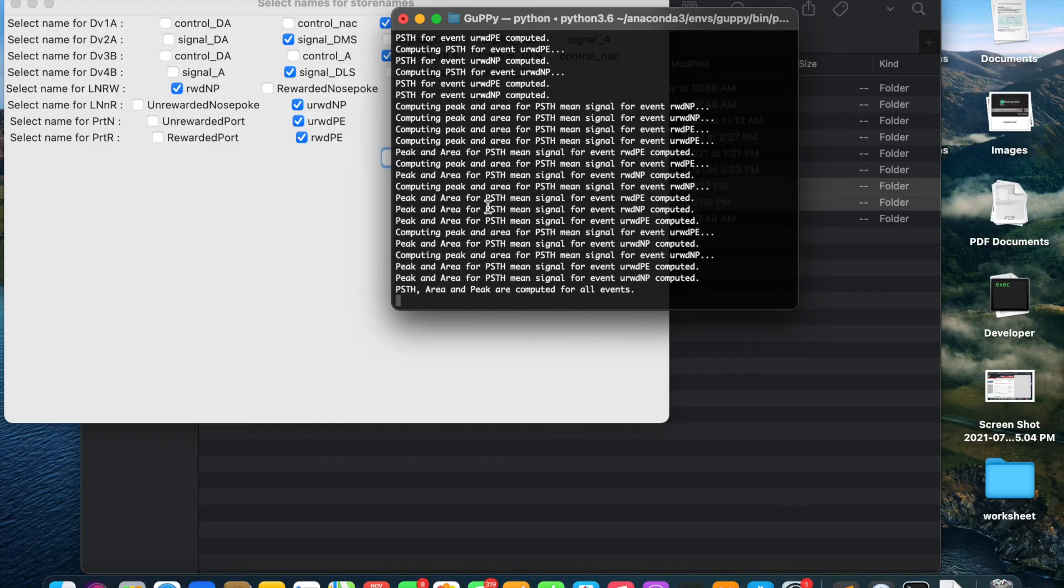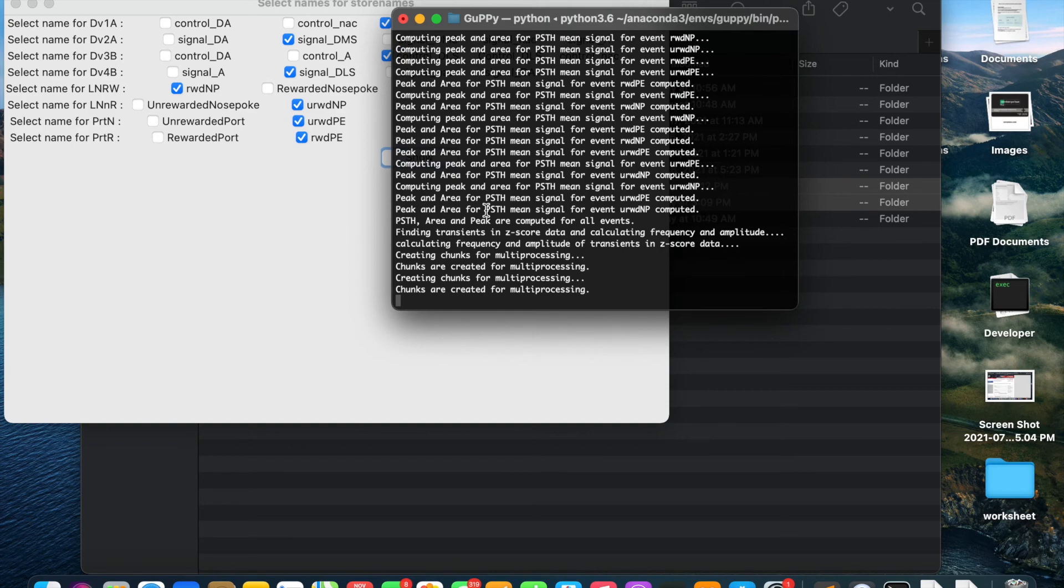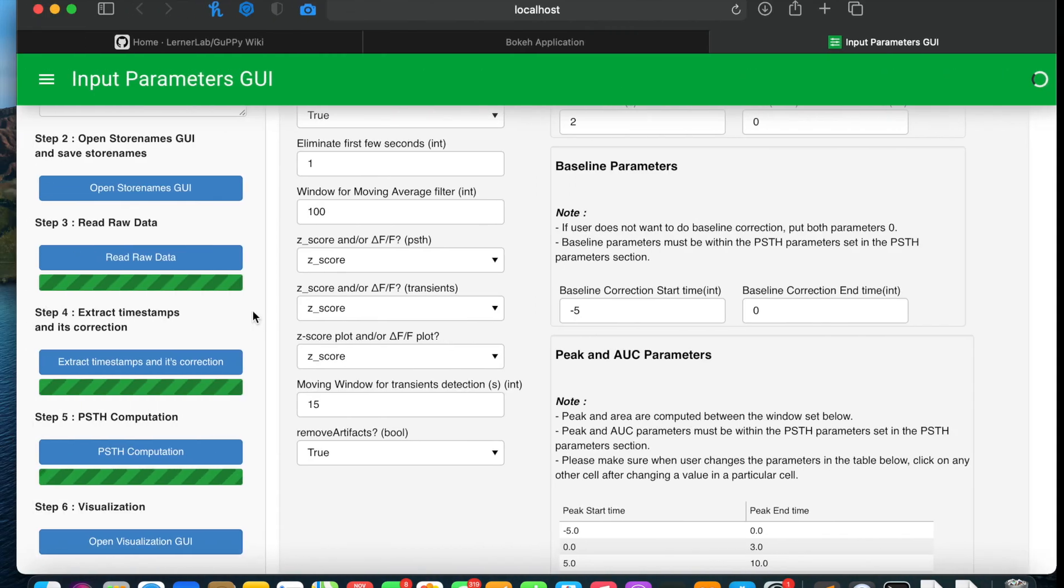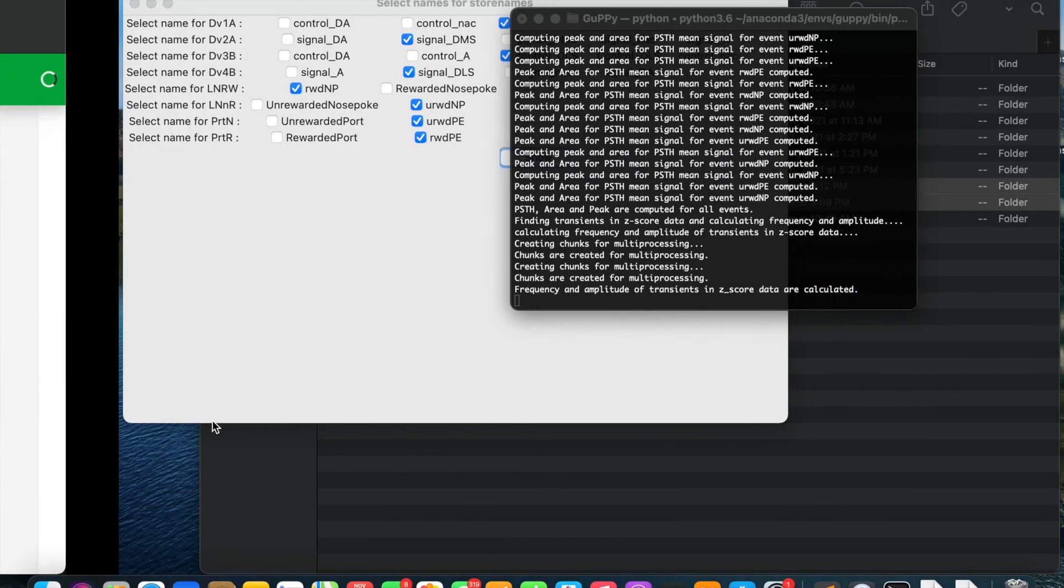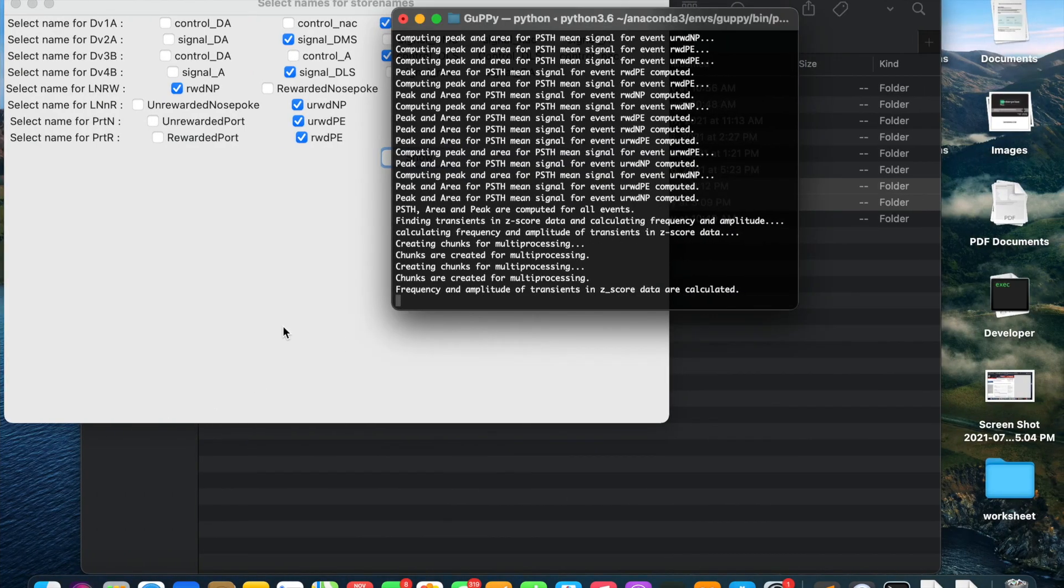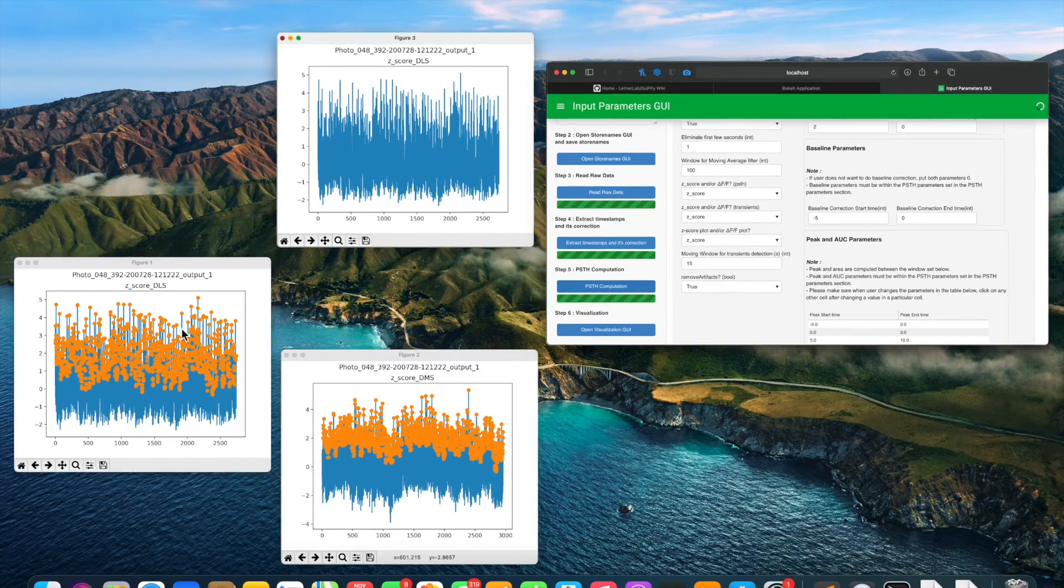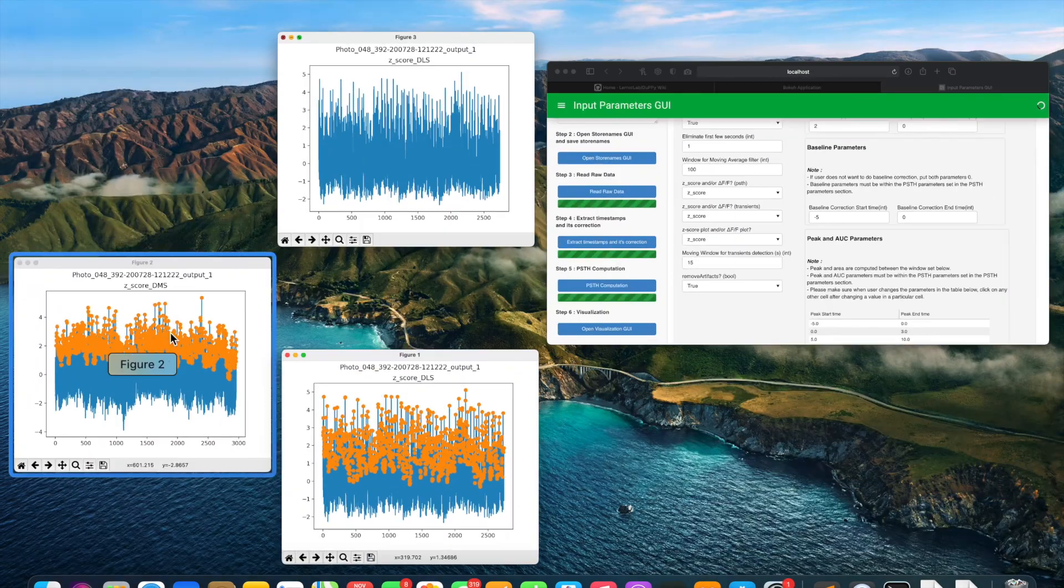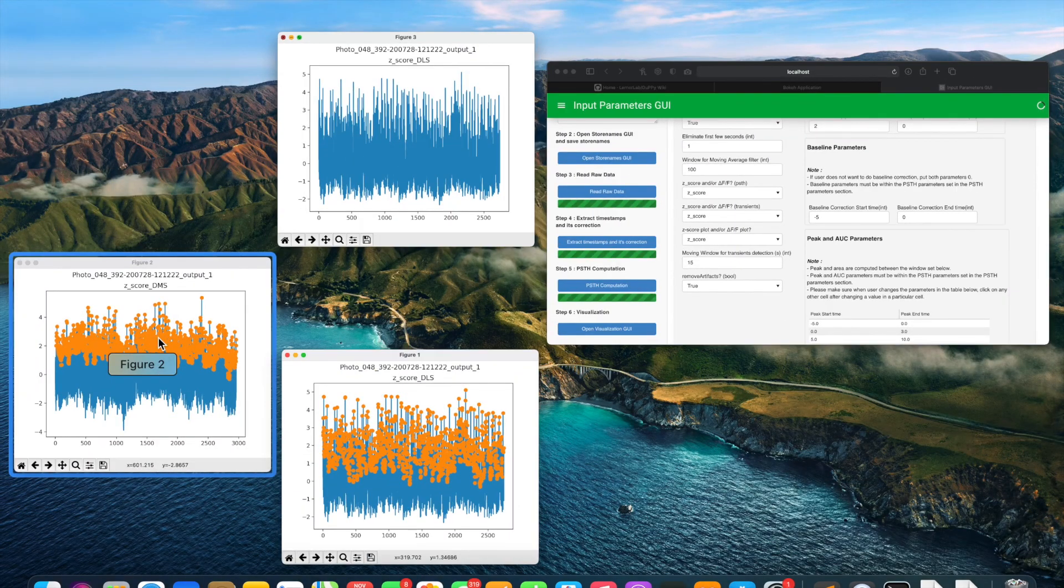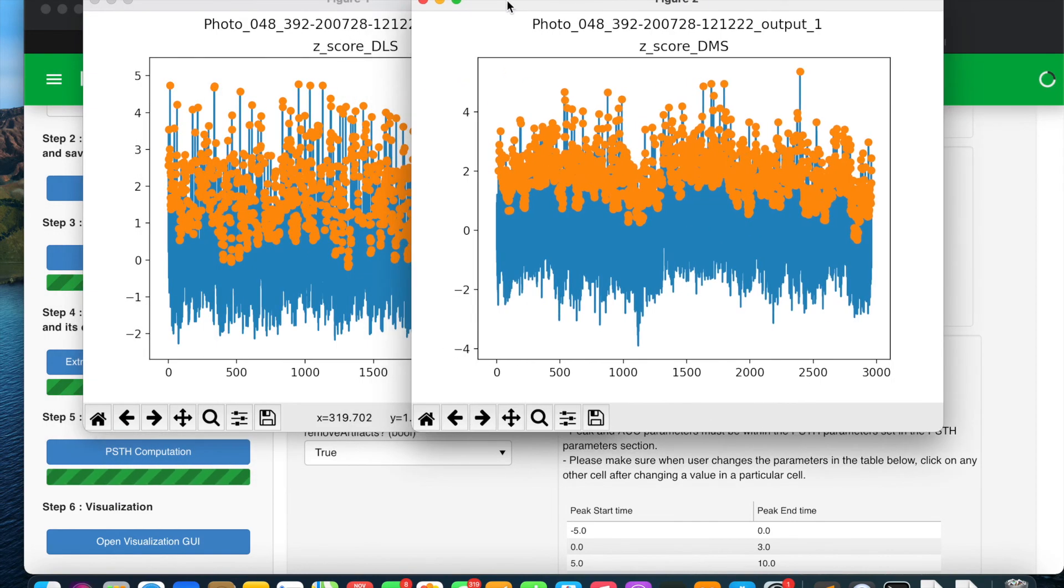This step is in progress right now. After PSTH computation step is done, we will see 2 plots like this. It shows the transient detection, how the transients got detected in the z-score trace. We will close these plots and move to open visualization step.